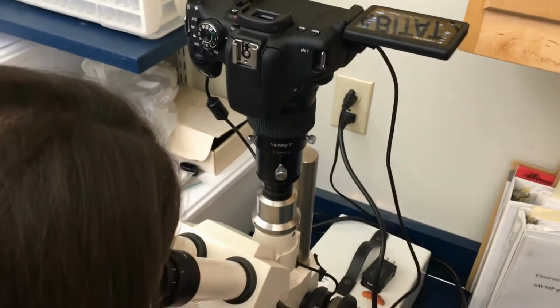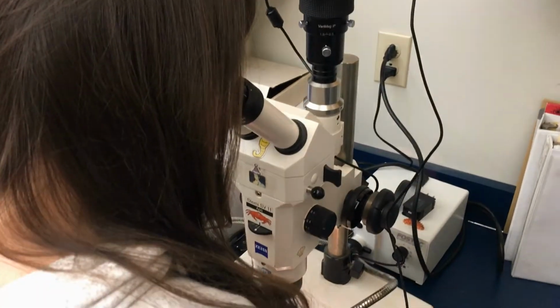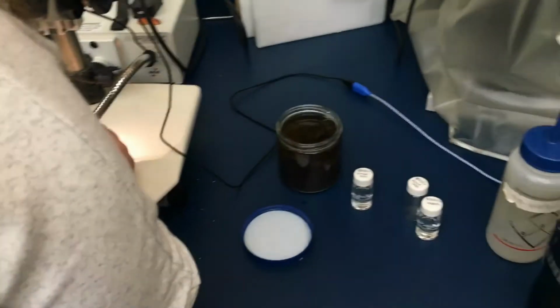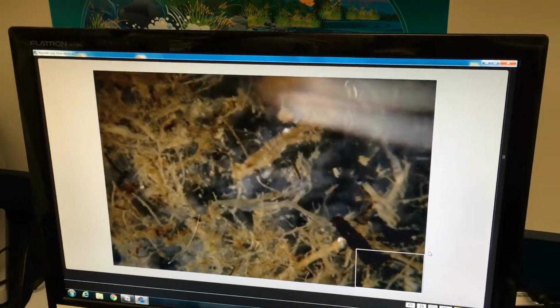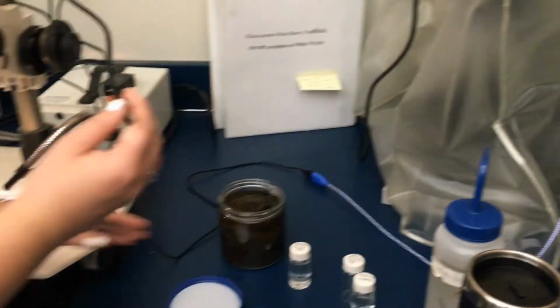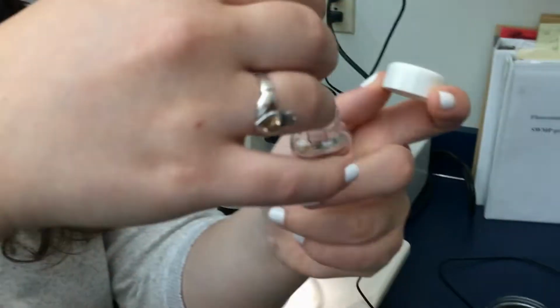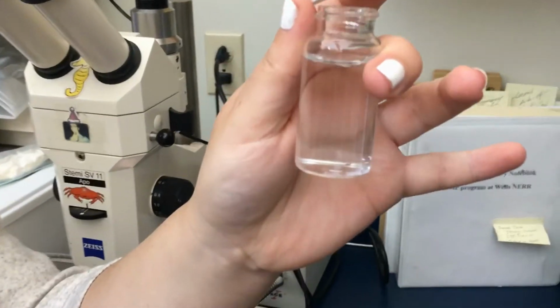The Wells Reserve has been conducting traditional larval tows at the same location for 10 years. Back at the lab, research assistants pick through the samples to find and identify larval fish, crabs, and invertebrates. We can compare the identified species from traditional larval tows and eDNA tows that were taken simultaneously, and these similarities and differences can tell us a lot about the efficiency and accuracy of our methods.